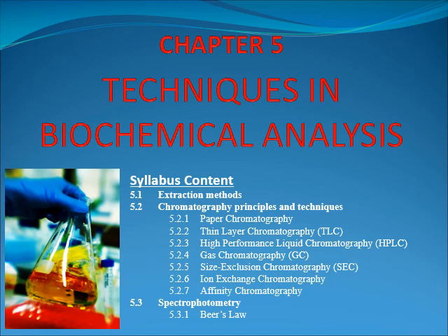So in this chapter, we will continue to focus on chromatography principles and techniques, which has about 7 techniques, and we already did paper chromatography and thin layer chromatography. So today we focus on the HPLC technique, GC, size exclusion chromatography (SEC), ion exchange chromatography, and affinity chromatography.